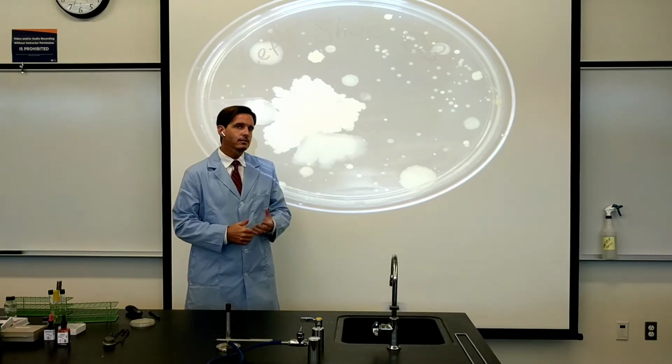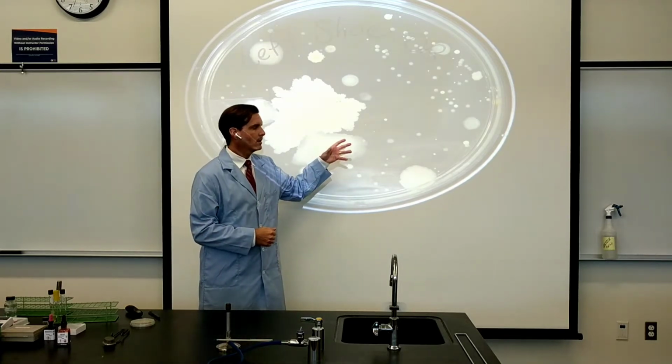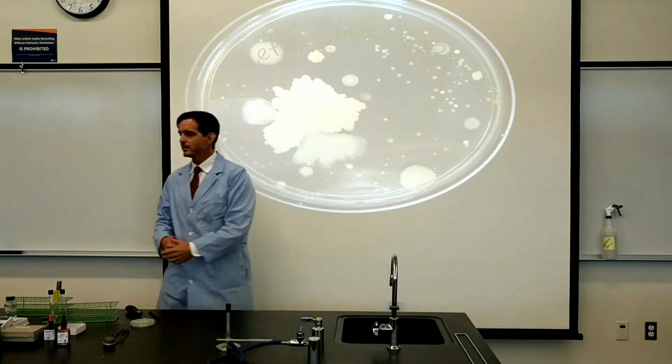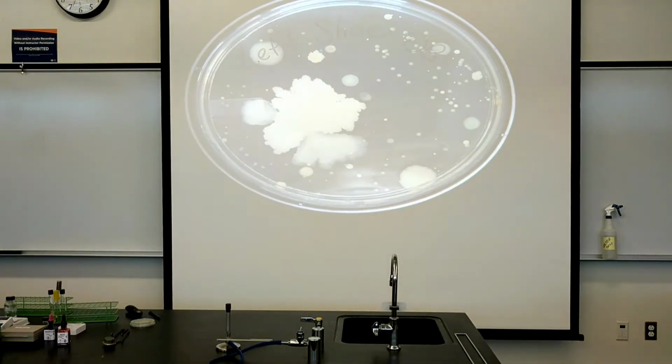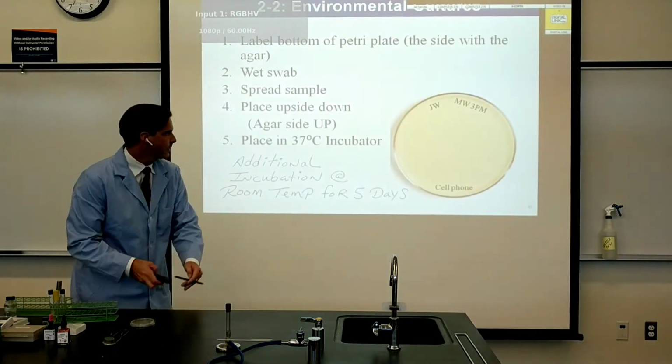Really what we need to do is think about what it means to make a colony. I'll come back to this because there's so many interesting things to look at. So let's look at bacterial growth for a moment and try to understand it a little bit better.